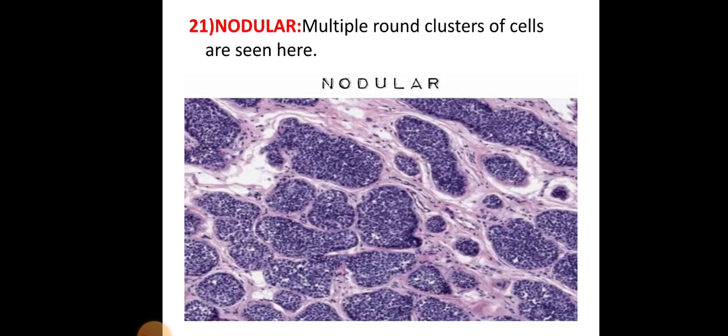In the nodular pattern, multiple round clusters of cells are seen.